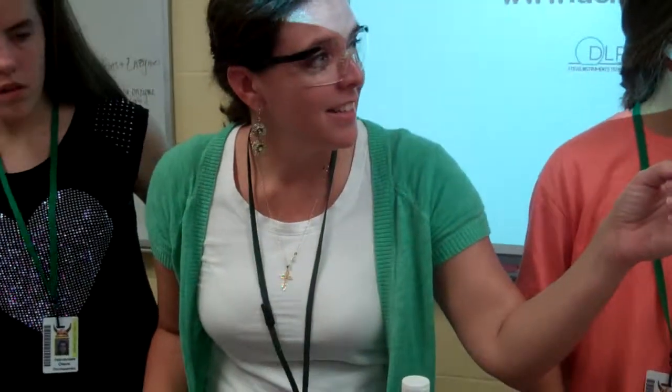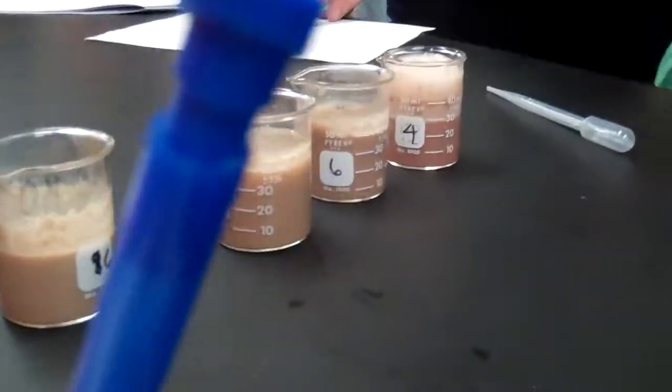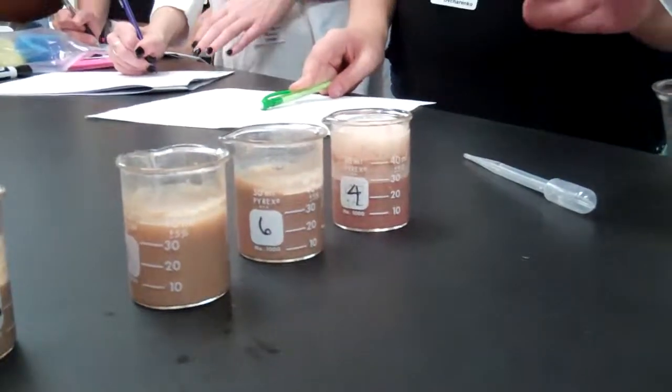Exothermic. So this reaction is an exothermic reaction, and it bubbled and fizzed, right? Okay, are you guys ready to see what happens when we put it on base? On a base? I'm gonna take that as a yes. Alright, here we go.